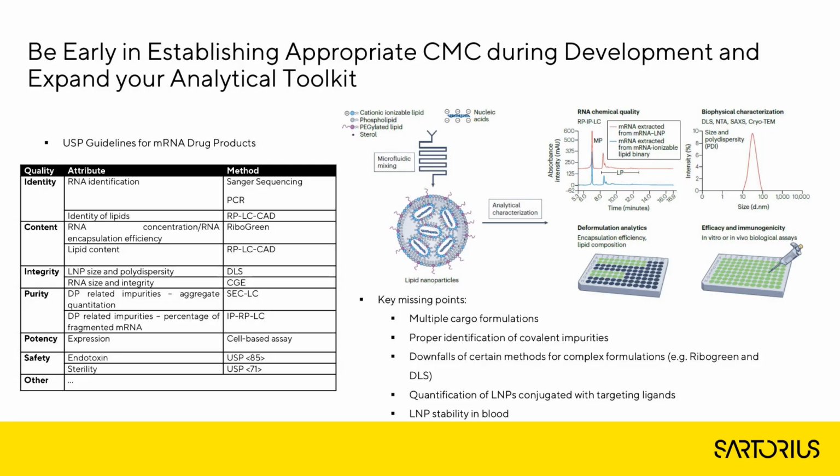So what I want to focus on first is the CMCs, and especially the characterization part of the lipid nanoparticles. I'm showcasing here the USP guidelines for mRNA drug products, which is currently drafted in this manner. We have, for example, RiboGreen or fluorescent-based assays for RNA concentration and encapsulation efficiency. We have some lipid content analytics, and we have LNP sizing and some purity assays.